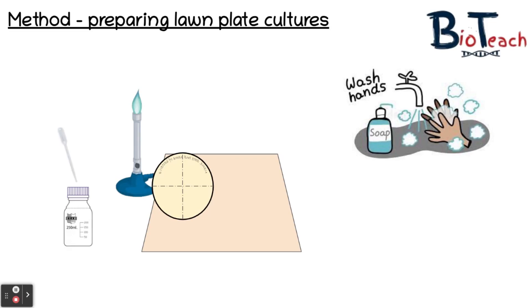You'll be given a sterile one centimetre cubed pipette and you're going to hold it very close to the Bunsen flame but not actually flame it, because these pipettes are plastic and will melt. With one hand you remove the lid of the McCartney bottle without putting the lid down, and you move the neck of the bottle quickly through the Bunsen flame — this stops any microbes from the air entering the bottle. You will squeeze the teat of the pipette into the McCartney bottle, place it into the broth culture, and when you release the squeeze you will remove a small volume of culture. You will again flame the neck of the bottle and replace the lid.